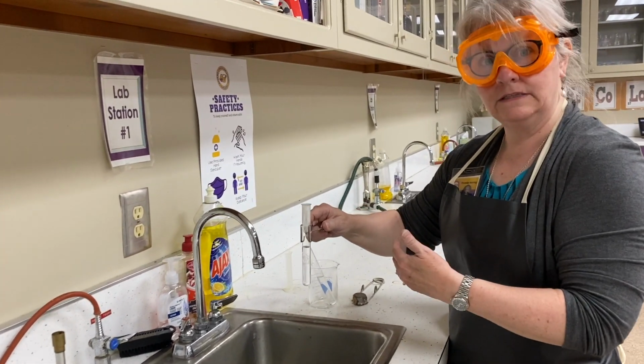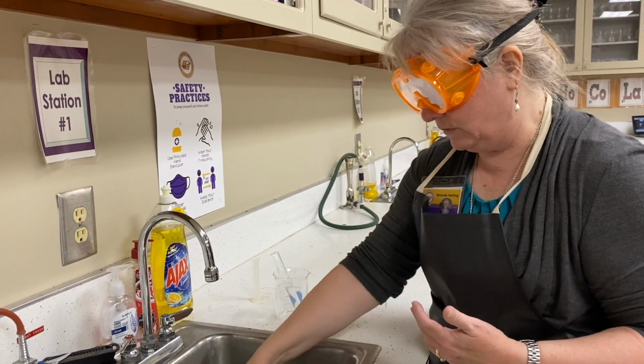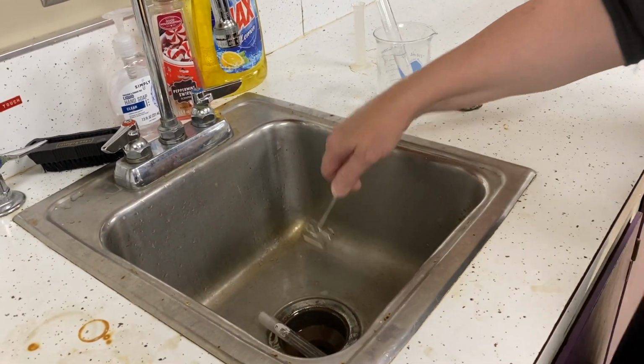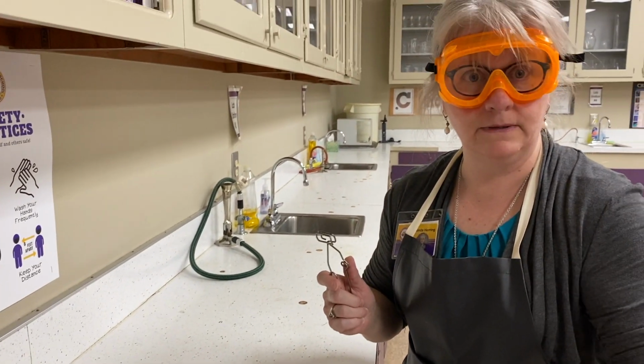So in order to complete this short little task, I want to just empty it into the sink upside down. I still have it. And then I want to just let go of the test tube gently into the sink so that it is just going to cool there. If I have time, my partner could pick it up and put it away.